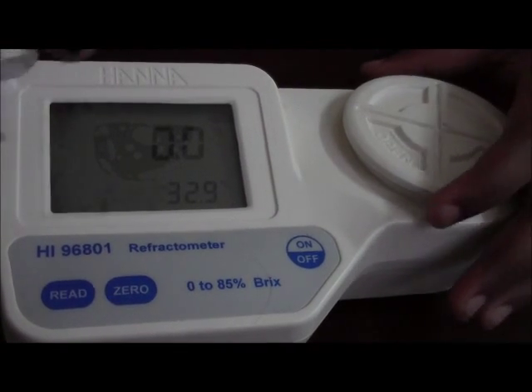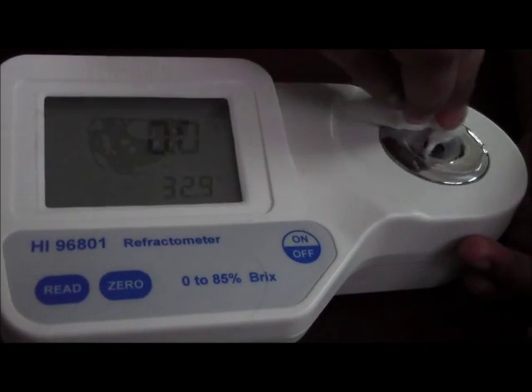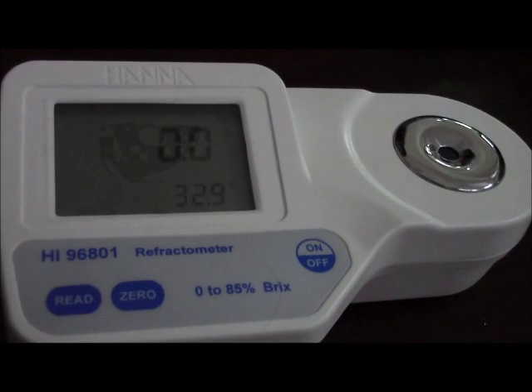Once the meter is calibrated, we would wipe off the distilled water. Now it is ready to read your sample.